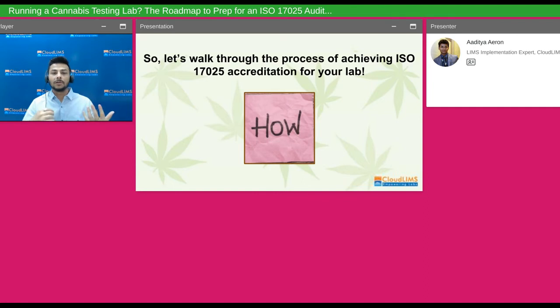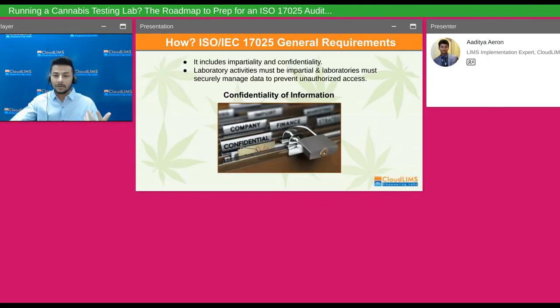So far, we covered the what of ISO 17025 and then why you need it. Now let's discuss how you can really go through this entire process and get accredited. There are some key requirements, which I categorized broadly, right from process to structural to general, the technical, and the management requirements. So let's go over them very briefly.